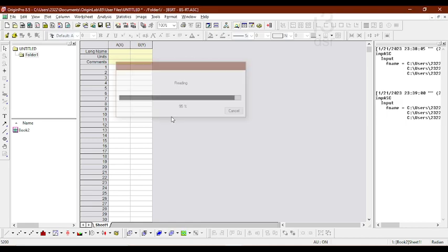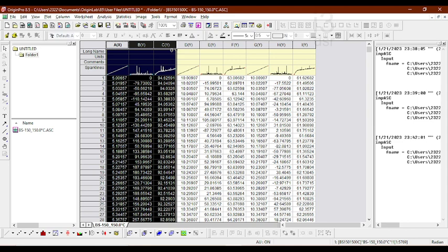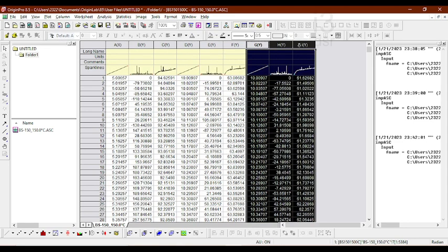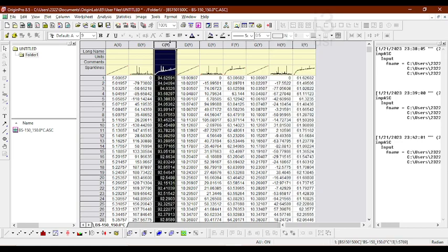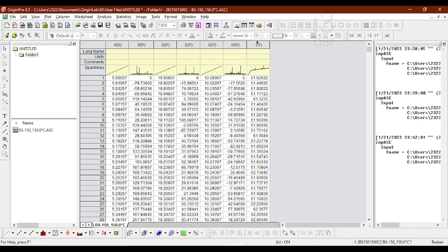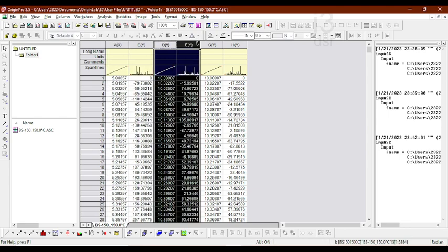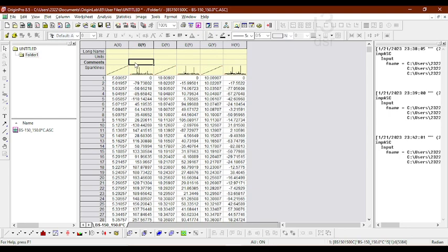Now first data is red, second data is red, third data is red, and everything. Now you could see these are the first data, this is the second data, and this is the third data. I said the third column is my own data, so I'm going to delete this, which you will not have in usual powder XRD data. So we have 6 columns, 1 2 3 4 5 6. As I said, this is room temperature, the Y data intensity is room temperature. You remember we did 100 as the second data and 150 as the third data. Now these are the 3 datas.